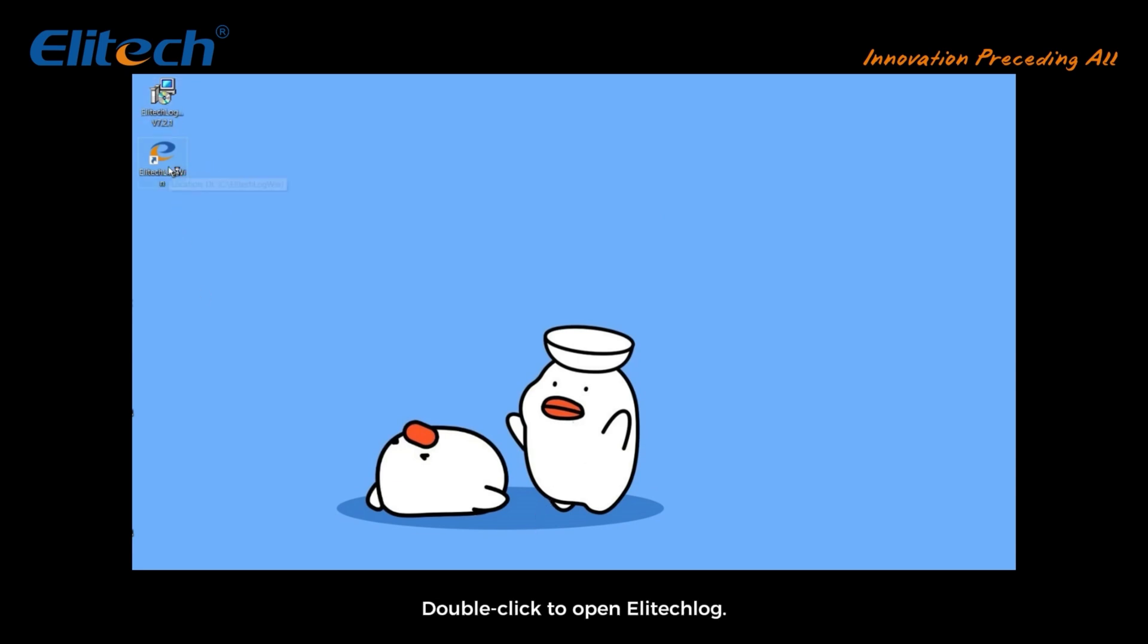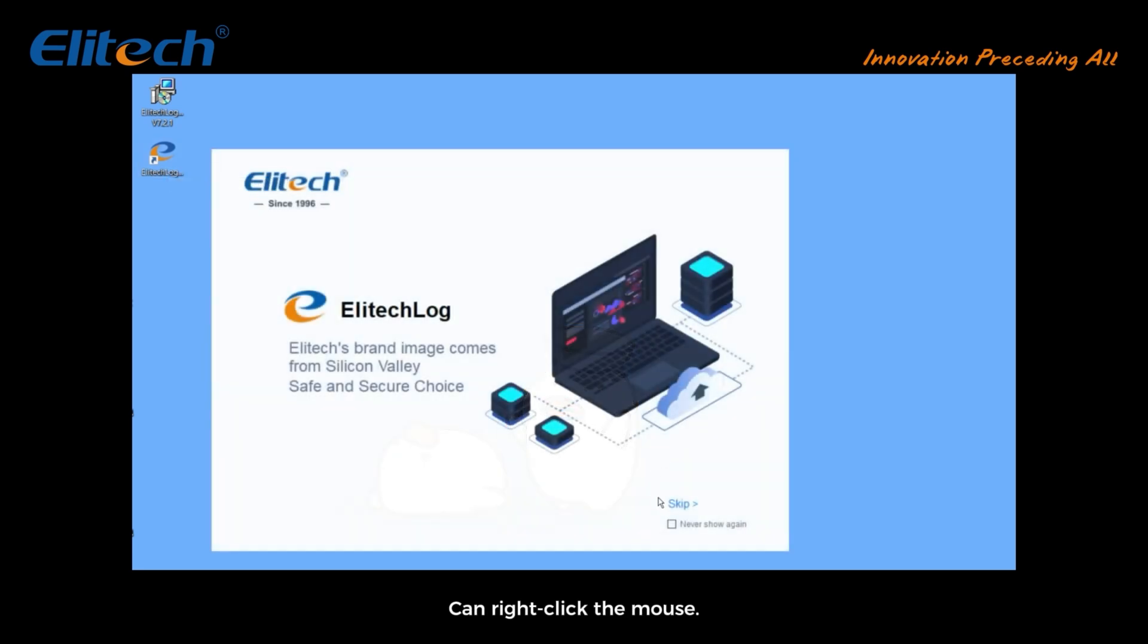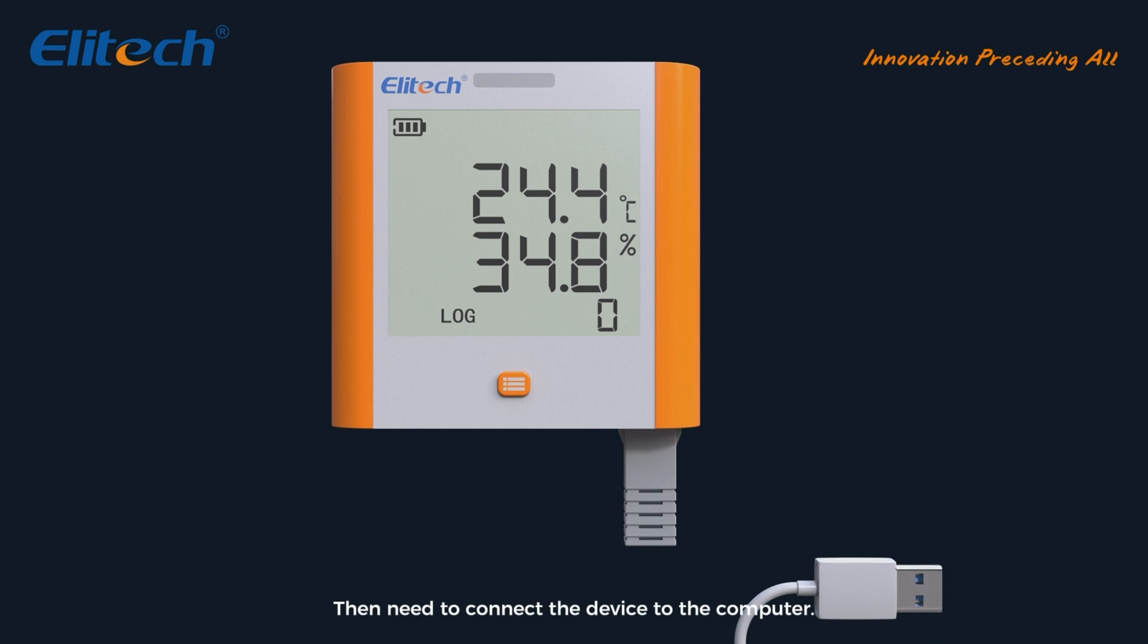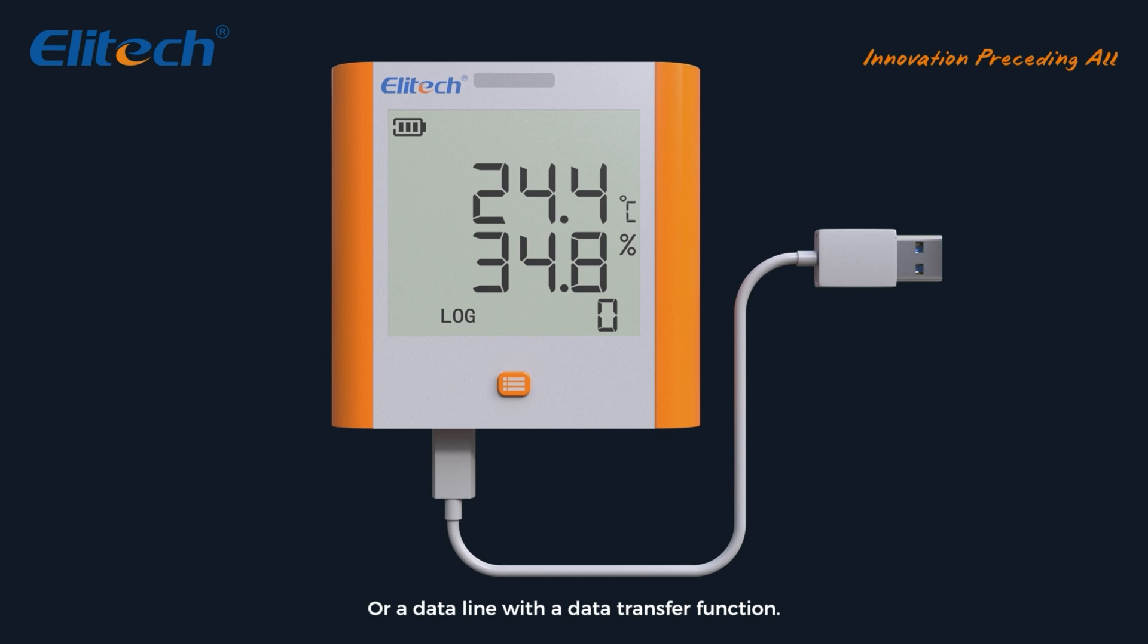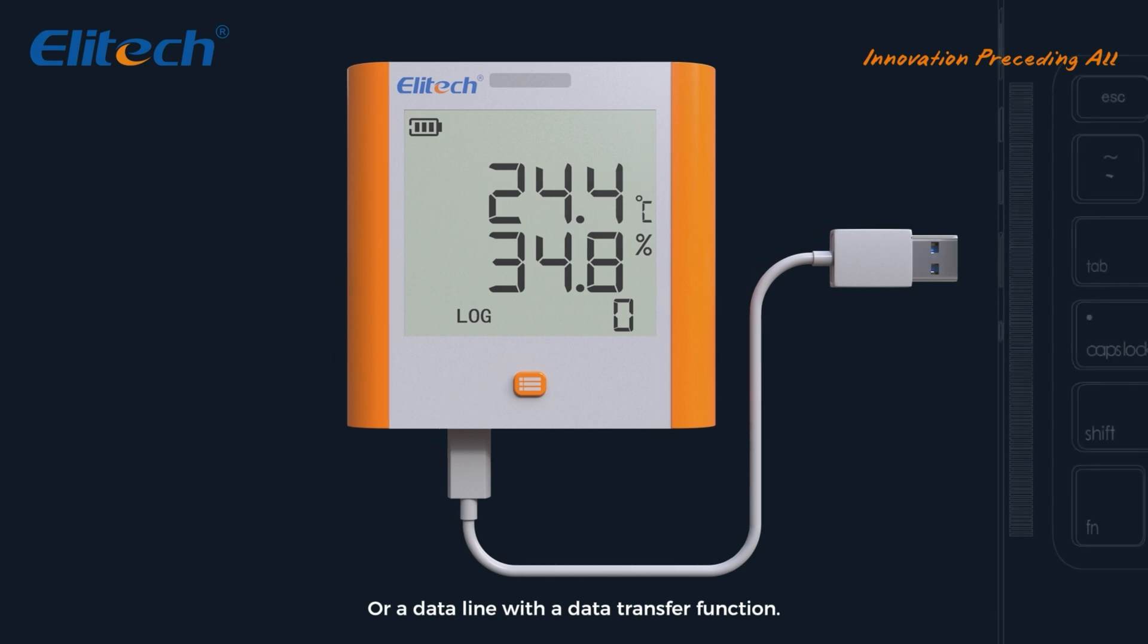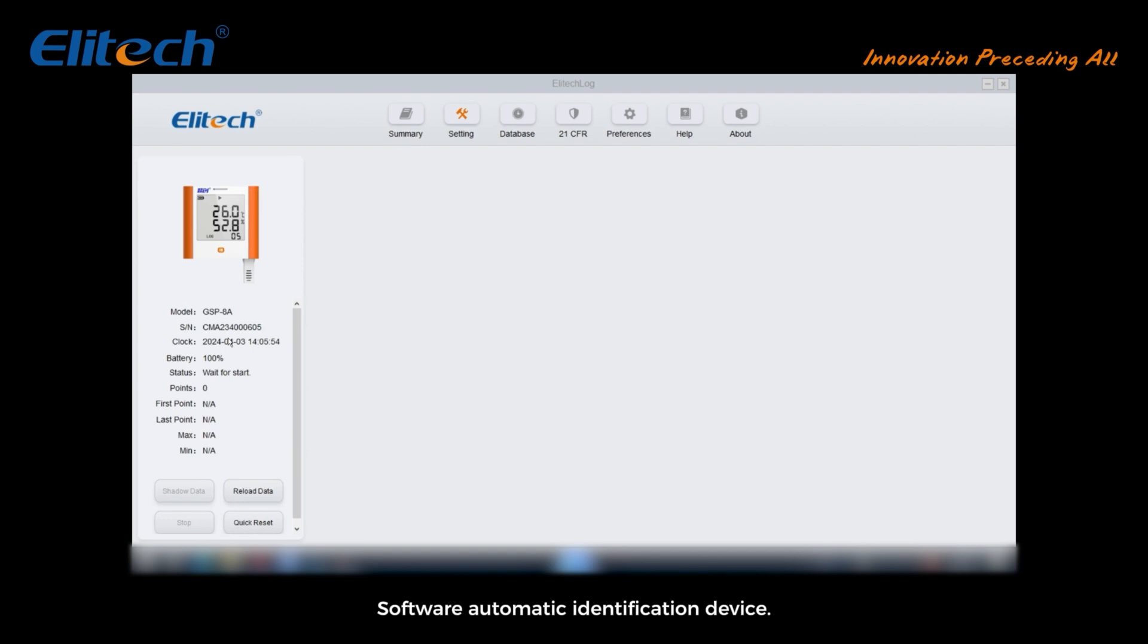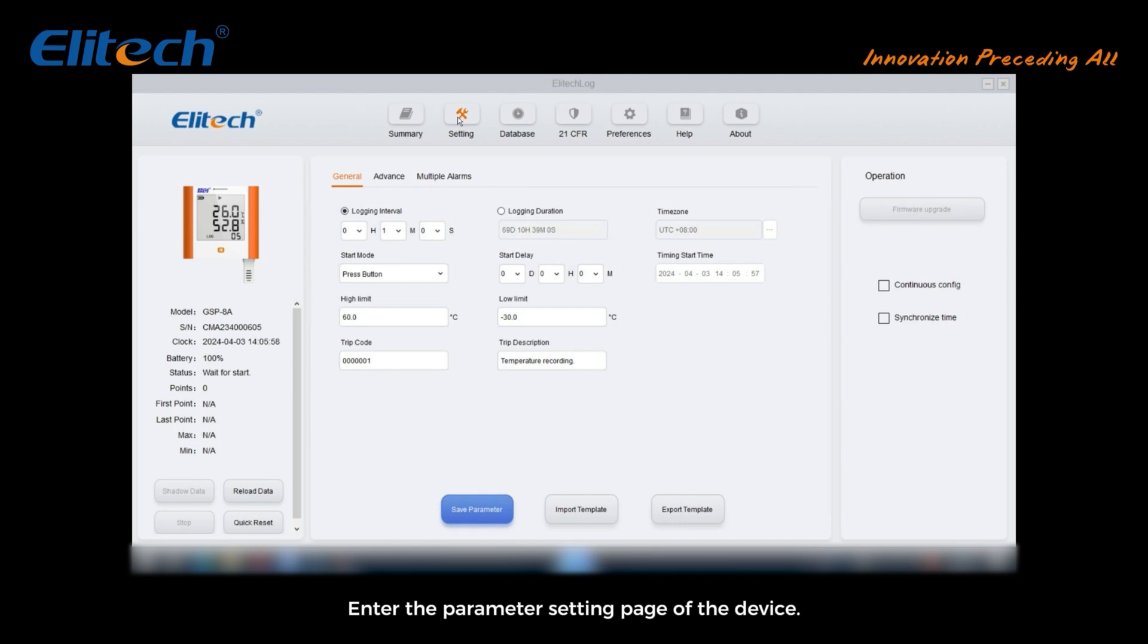If double-click fails to open, right-click the mouse and select run as administrator. Then you need to connect the device to the computer. Please use the original data line or a data line with a data transfer function. A lot of lines only charge. Software will automatically identify the device. Click the setting button above to enter the parameter setting page of the device.